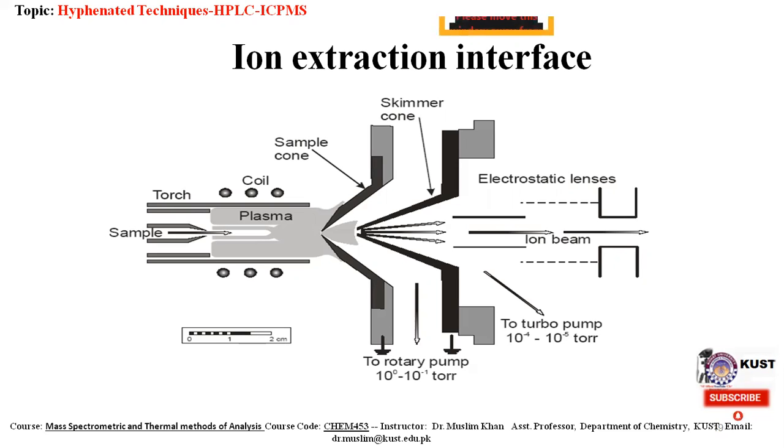If this were not eliminated, it would result in an electrical discharge called a secondary discharge or pinch effect between the plasma and the sampler cone. This discharge increases the formation of interfering species and also dramatically affects the kinetic energy of the ions entering the mass spectrometer, making optimization of the ion optics very erratic and unpredictable.